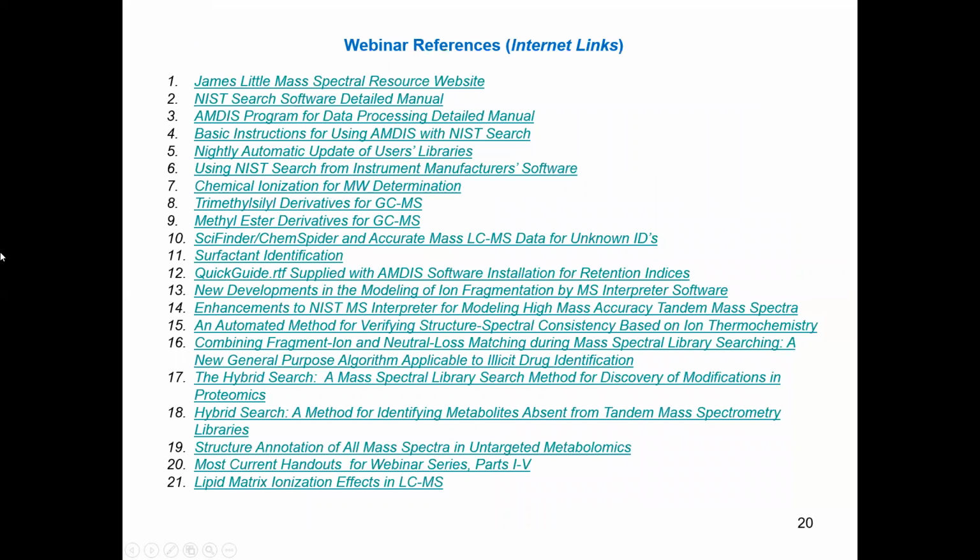So that's pretty much the end of the webinar. We've gotten to the end. This has been about 30 or 40 minutes, but the other things I have on my website are listed here, and they're all linked within the handouts, so you can see where they came from and where the internet links are. I think you might find this useful in some of your work if you want to know about these other topics. And the manuals are linked here. The different resources are also here. If you just hover for a second, it shows you they're actually all internet links.